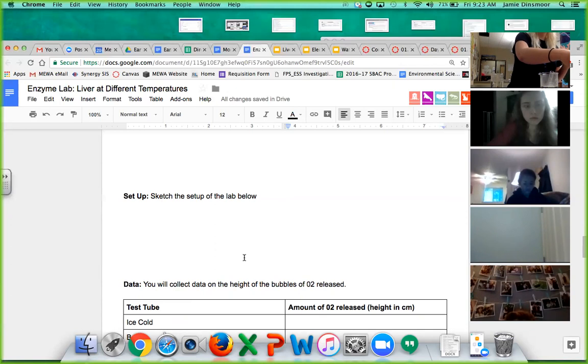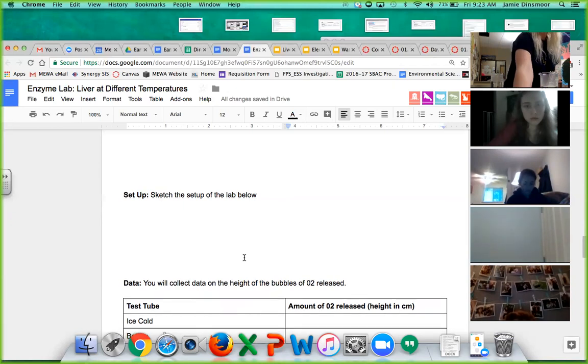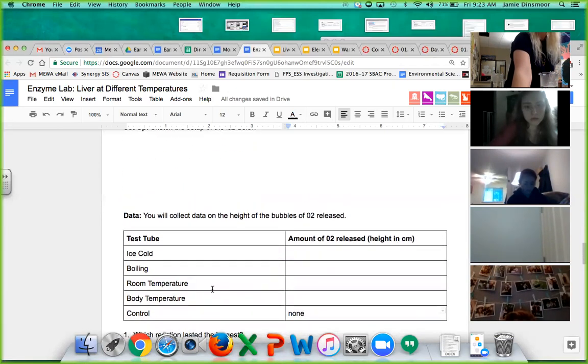And that's how we're getting it to the temperatures. So this looks good, actually. Our room temperature water, which we will write our actual temperatures here just as a reference, is 22 degrees Celsius.